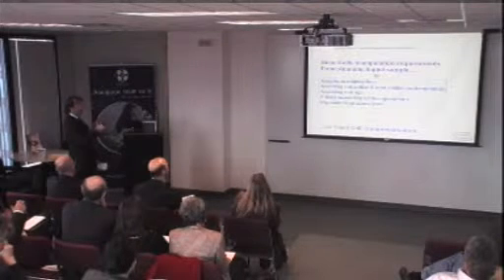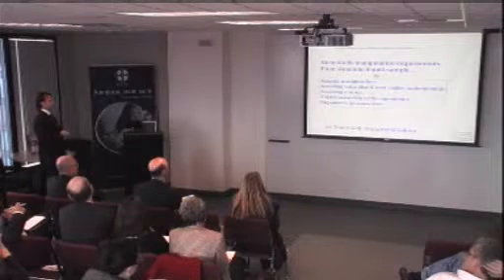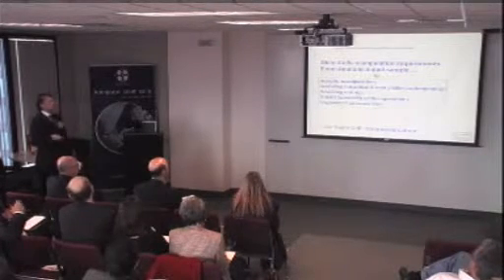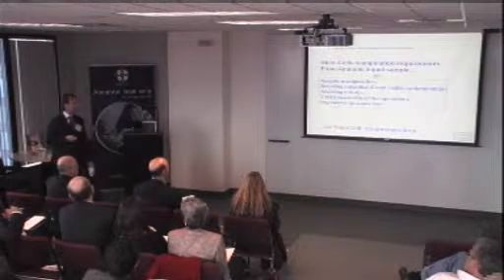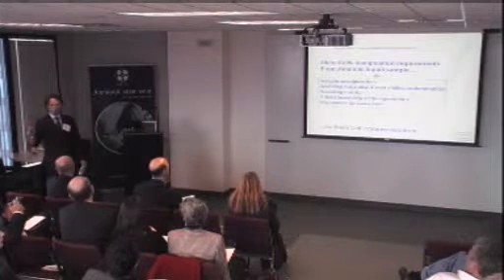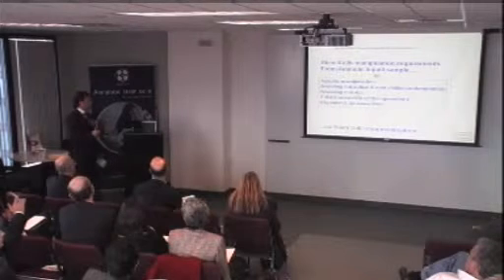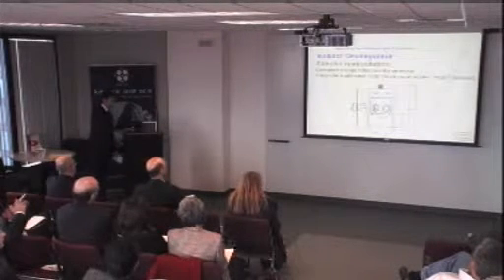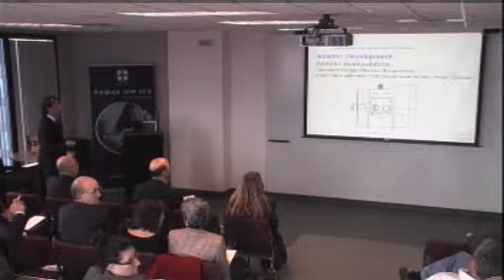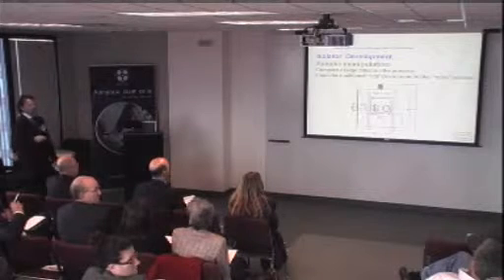First of all, aseptic manipulation. Then we have to avoid microbial contamination and non-viable contamination, particulate matter. We need to avoid mix-up, we need to have total traceability of the operations done on the cells, and we also need an ergonomic process. I will show you why. So, I will go through each of those requirements in order to show you the approach and the solution proposed. First of all, aseptic manipulation.